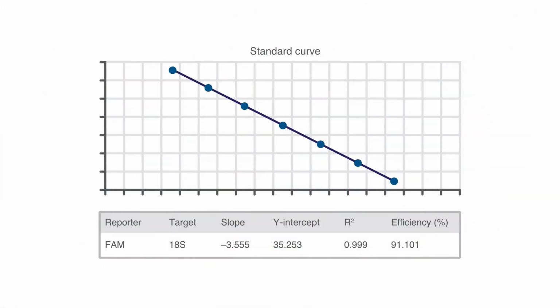We can also see outliers on the opposite end of the curve for our most dilute samples. These high CT outliers are generally the result of a low copy reaction. They're ordinarily seen at CT values above 35 cycles and can increase or decrease the slope. This is normal for samples in the 1 copy range and can indicate the limit of detection for your assay. If you have one of these types of points in your curve, you can omit and update the data. Aha! Notice the improvement in our efficiency.